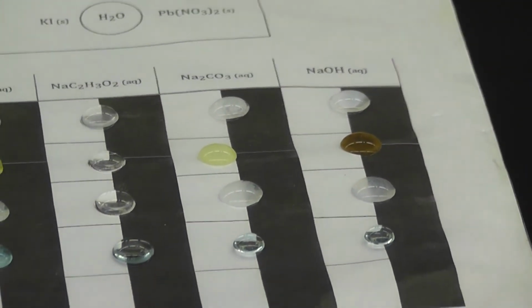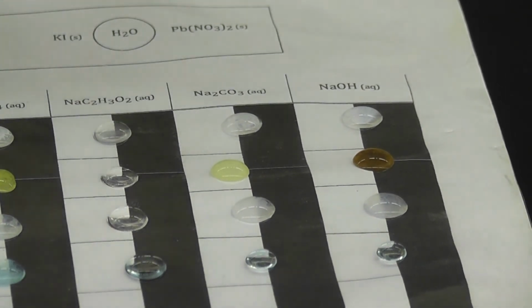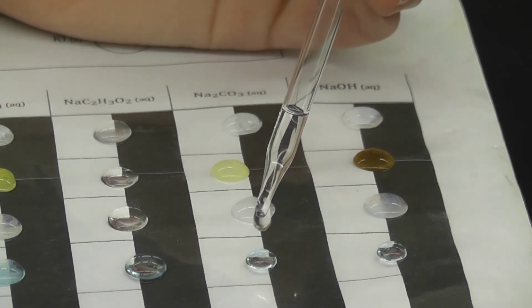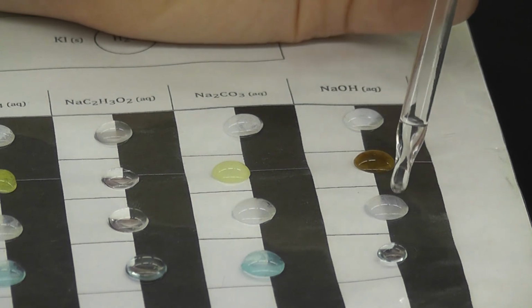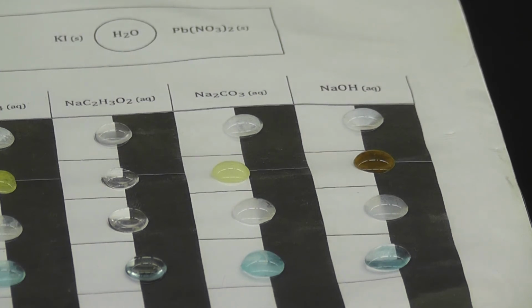Next, copper 2 chloride with sodium carbonate. So we have 2 more. 1 drop of sodium carbonate. So that reaction. Okay. Next is copper 2 chloride with sodium hydroxide. Just 1 drop. Okay, that's the copper 2 chloride row.